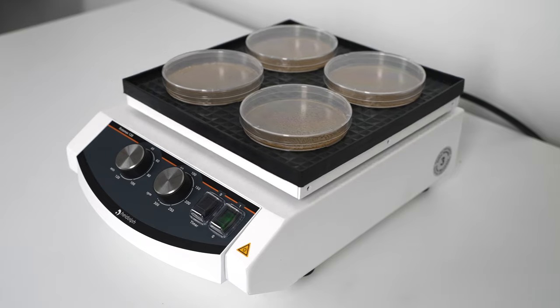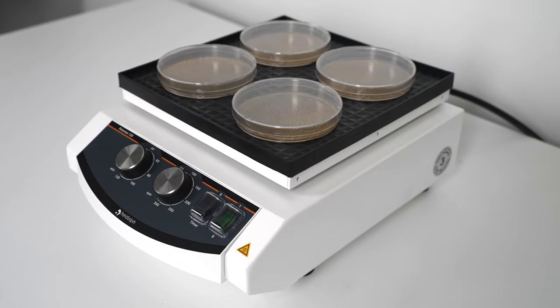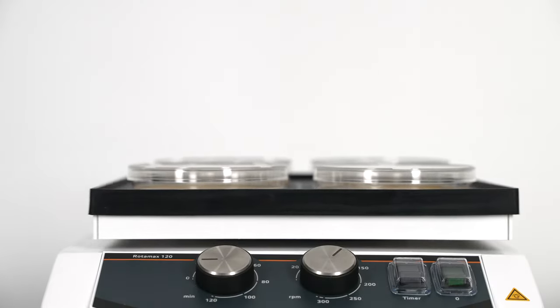The Rotamax 120 shakes at speeds between 20 to 300 rpm and has a maximum orbit of 20 millimeters. The Rotamax 120 has two modes: a continuous mode for extended use and a timer mode for any preset times your protocol or SOP requires.